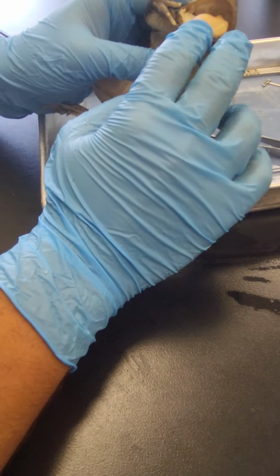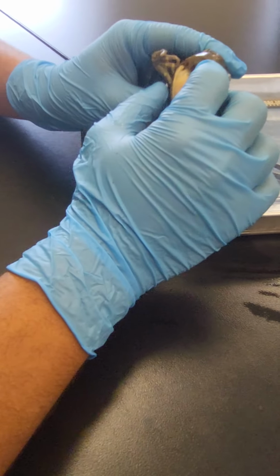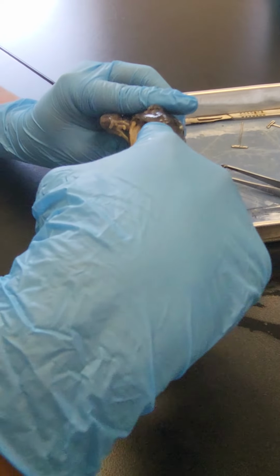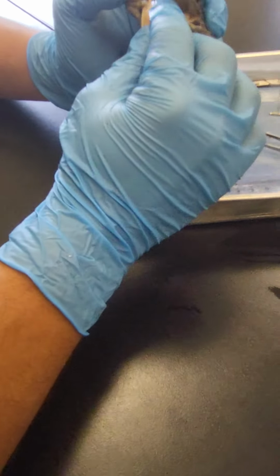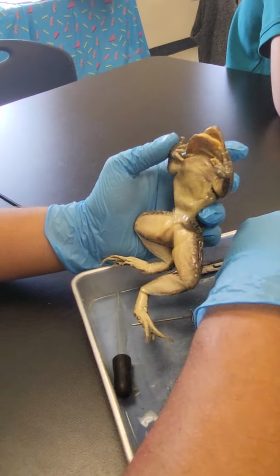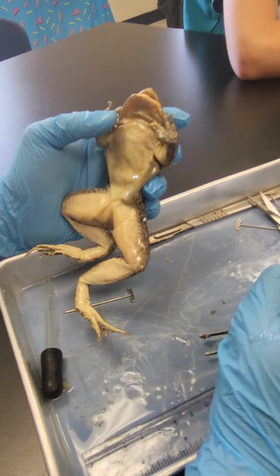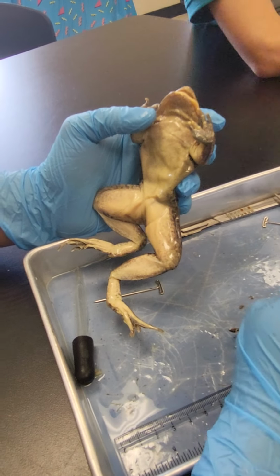And in the center of the mouth, towards the back, is a single opening, the esophagus. See if it leads to the stomach. Use a probe to poke into the... not your finger! The esophagus? One of these things. Which one's the probe? Did it say anywhere? I think this was a pin. I think the blue one might be it.